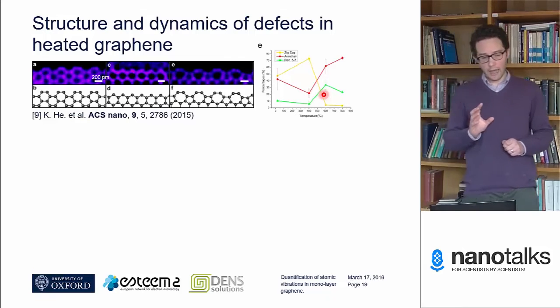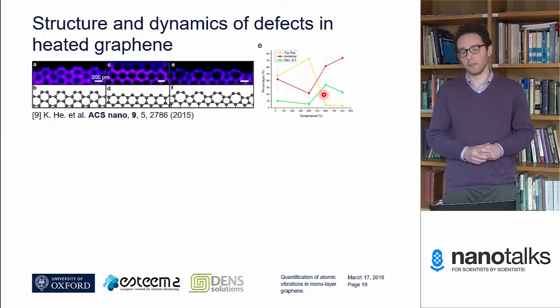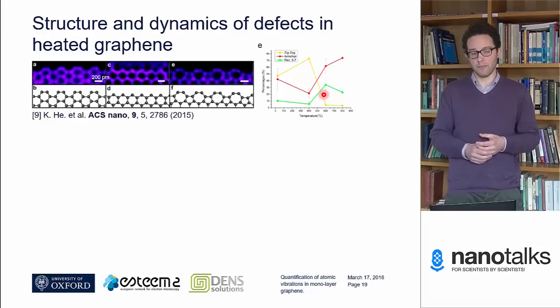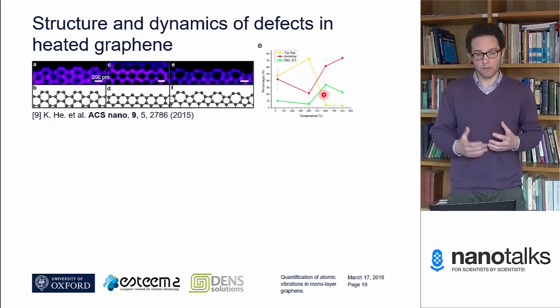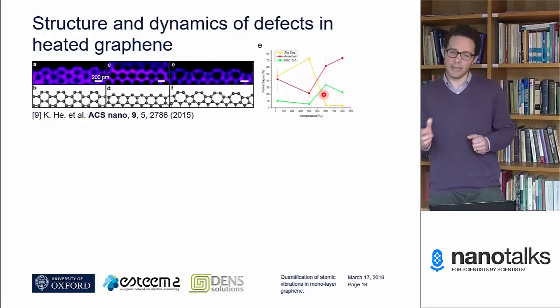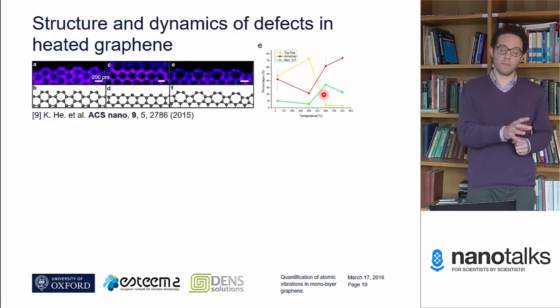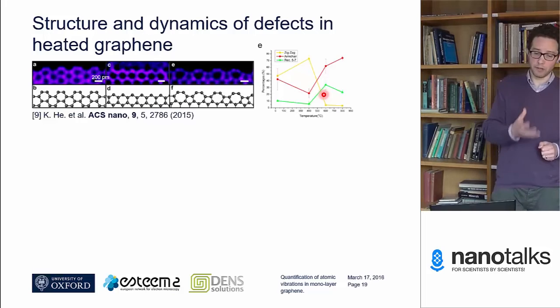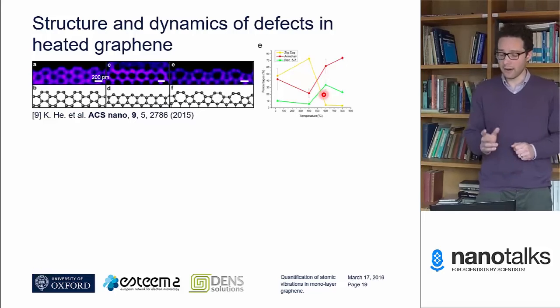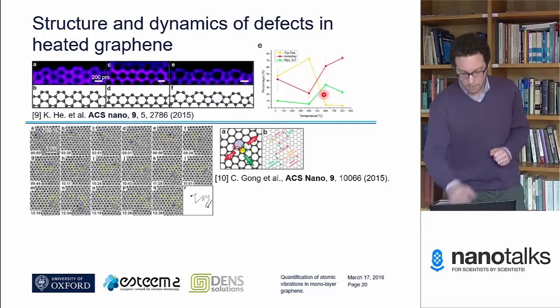One slightly counterintuitive thing that came out of this study, though, is that we find that edges are actually more stable at higher temperatures. As we increase the temperature of our sample, our edges are stable for longer periods of time. And again, if we think back to the sputtering cross-section arguments I was giving earlier, the phonon-mediated damage mechanisms, this seems slightly strange.